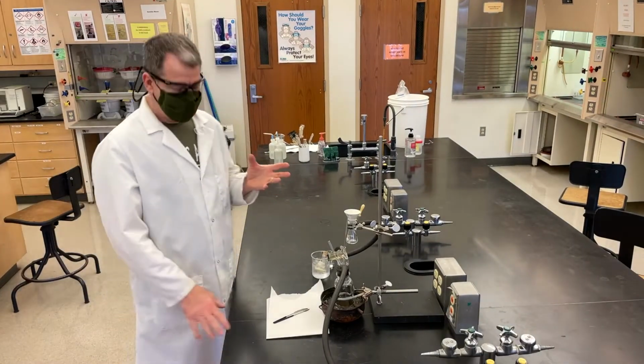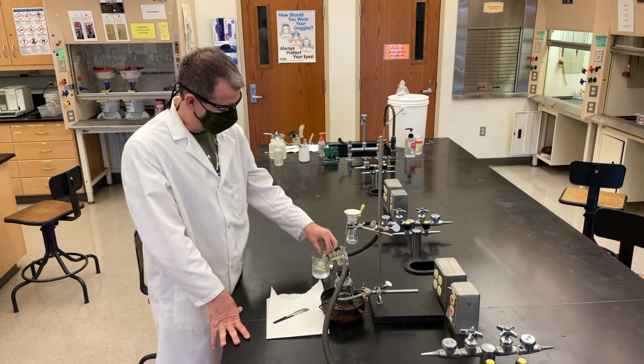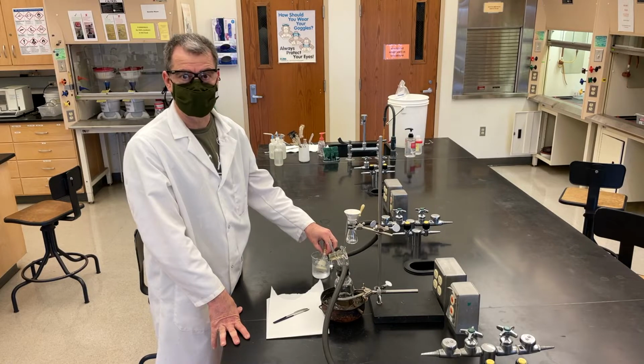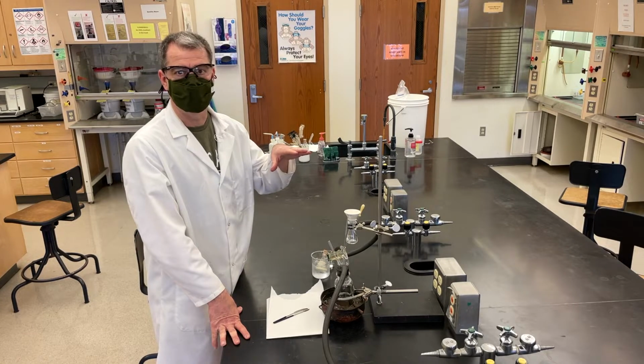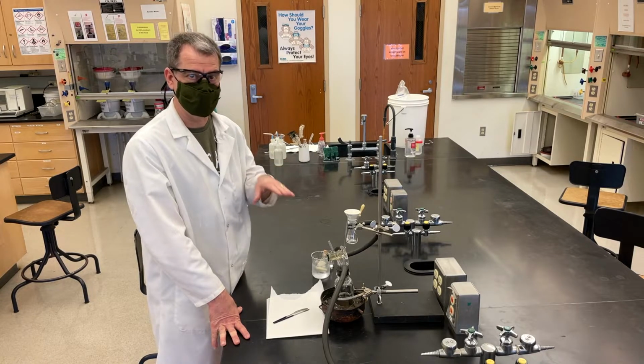Okay, so what you saw there was a little video of me setting up the filtration apparatus. We have our benzoin crystals. They're sitting in ice water, so we're making sure that we're lowering the solubility of that material in the solvent system, crystallizing out as much as we possibly can.